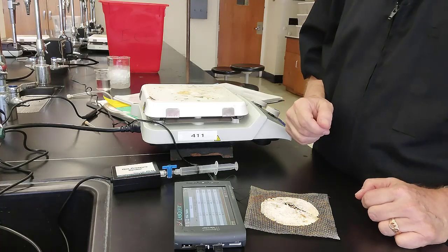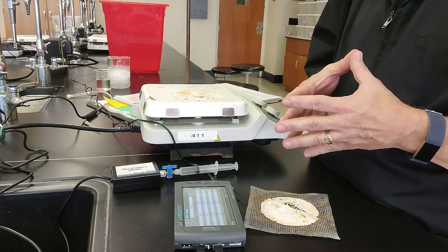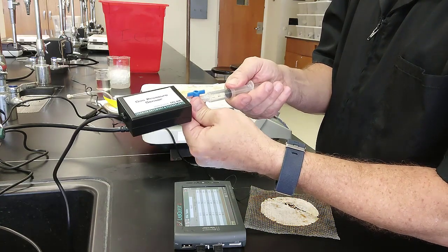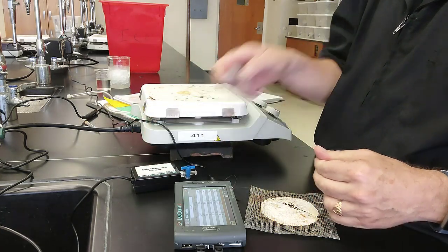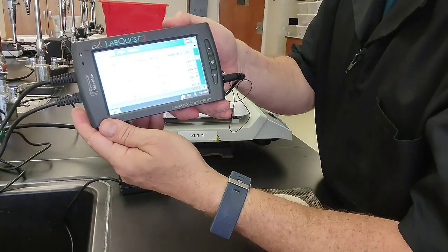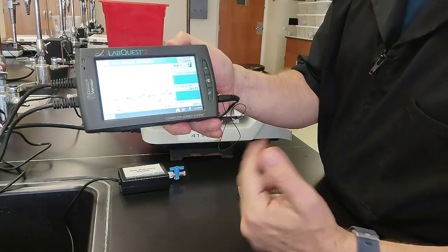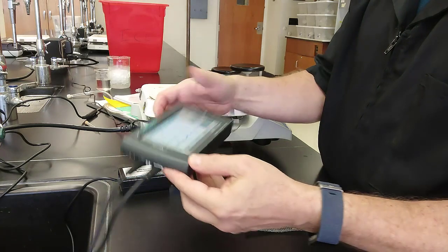Next up, Gay-Lussac's law, exploring the relationship between pressure and temperature. So we will disconnect our syringe from our gas pressure sensor. Set that aside, I'm not going to need it right now. We will take our Vernier interface and put it back into the graph mode, just so we can see. We can always switch back and forth if we want to. And it's ready for the next run. We would just do run 2 there.